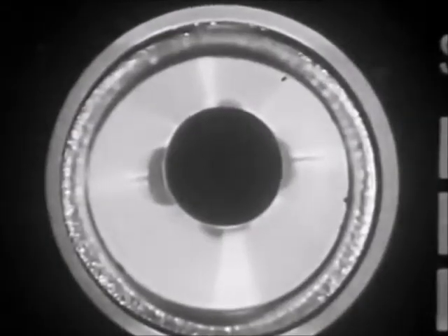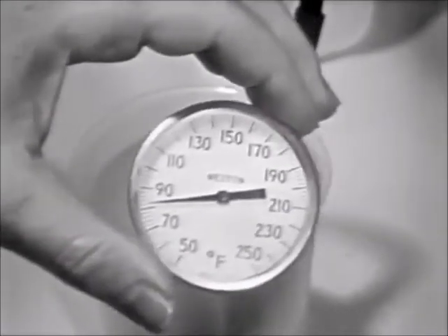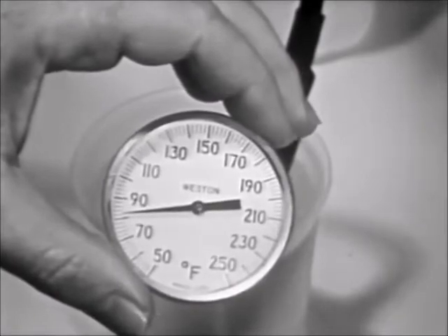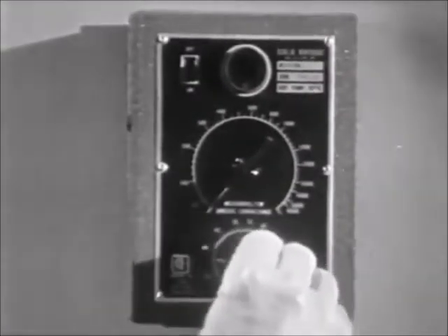Next, read the temperature of the solution using the thermometer. In this case, the reading is 82 degrees Fahrenheit. Set the meter's temperature compensation dial to the corresponding value.